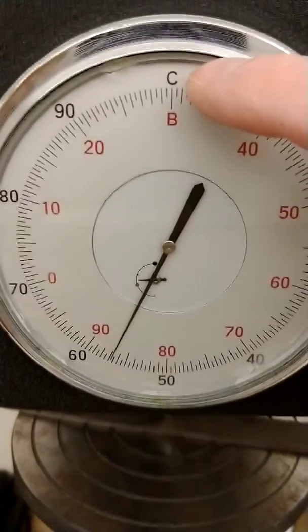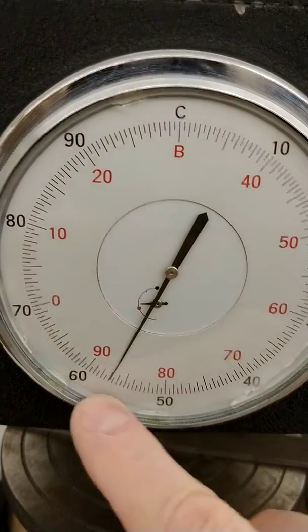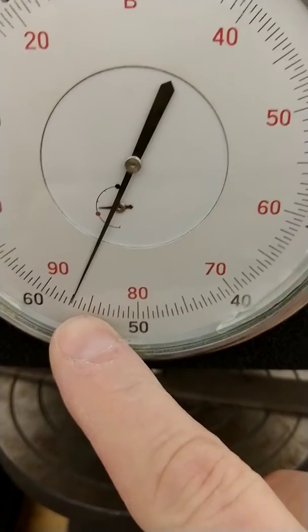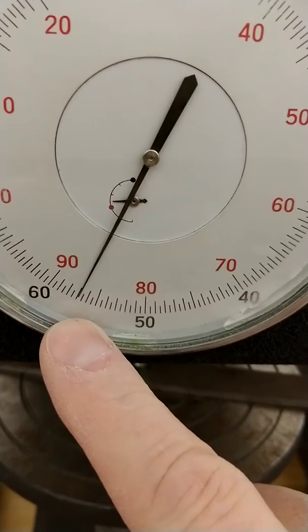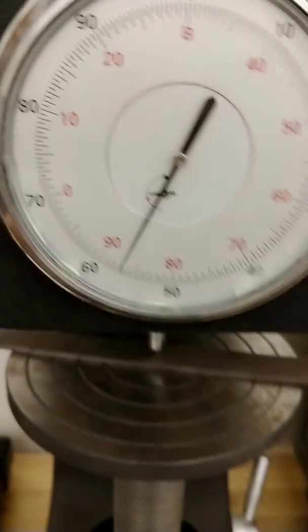The Rockwell C number is on this outside black set of indicators right here, and that's pointing at about 56 to 57 Rockwell C. So that file is about 57 to 58 Rockwell C, and that's about the right number for a file.